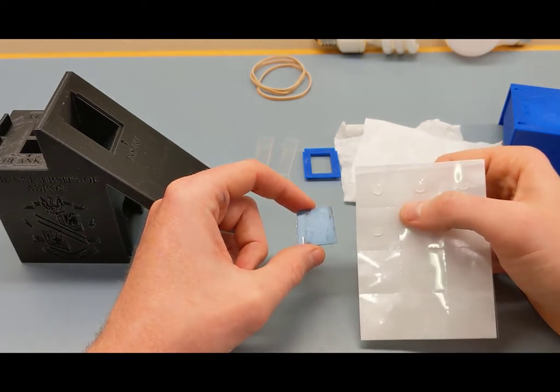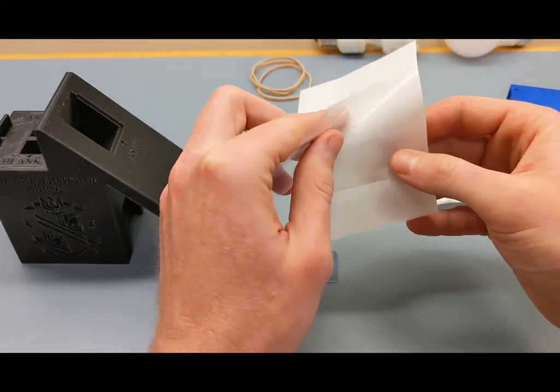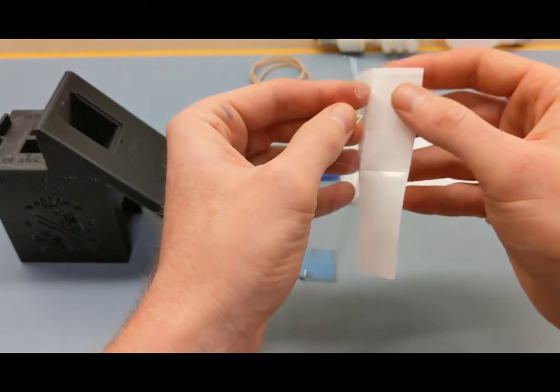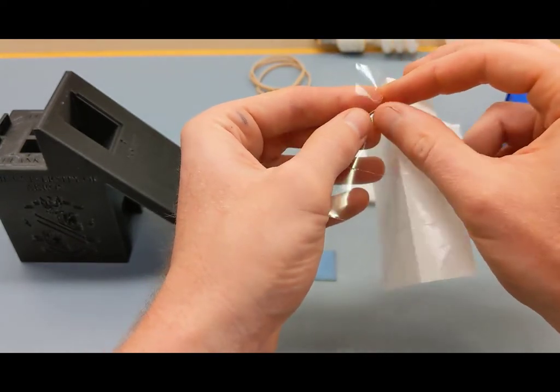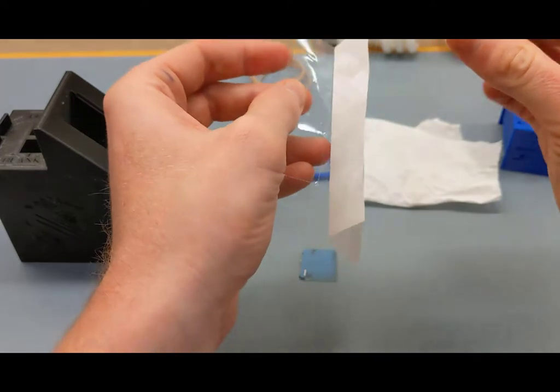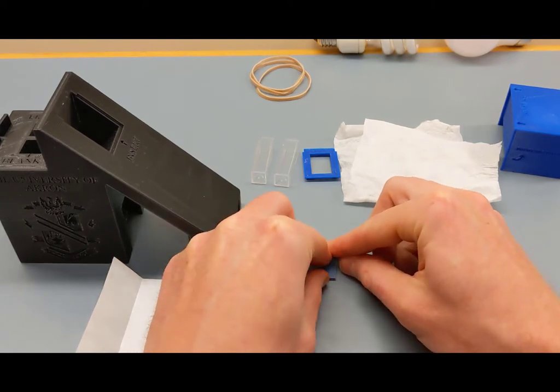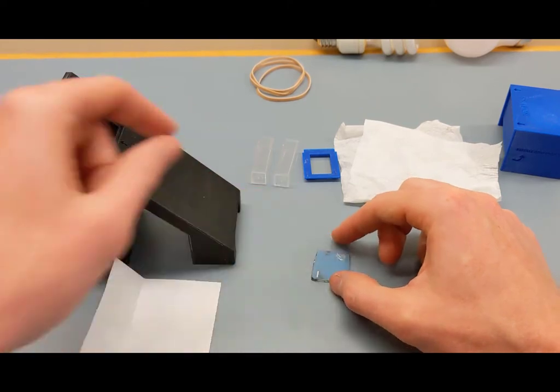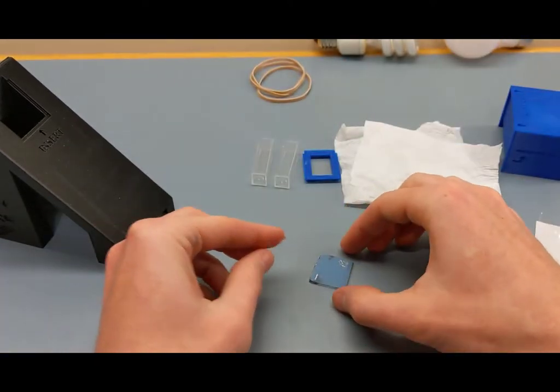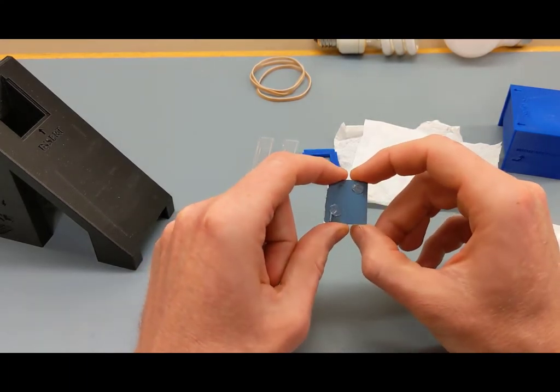These glue dots are essentially double-sided tape — a little easier to use than regular tape. There's a top sheet and a waxy backer sheet. You'll need two dots. Peel the top sheet off to expose the dot itself — it takes a little effort to de-stick it. Fix one dot to the top corner of the mirror, then do the same for the second dot on the other corner.